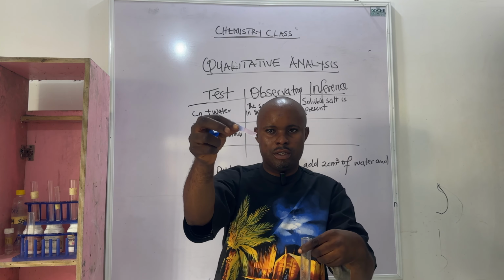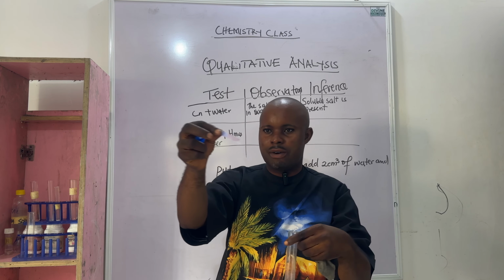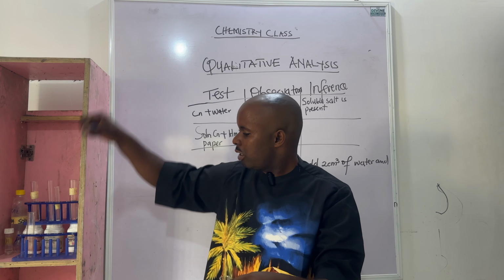Okay, you can see it changes blue litmus paper red.